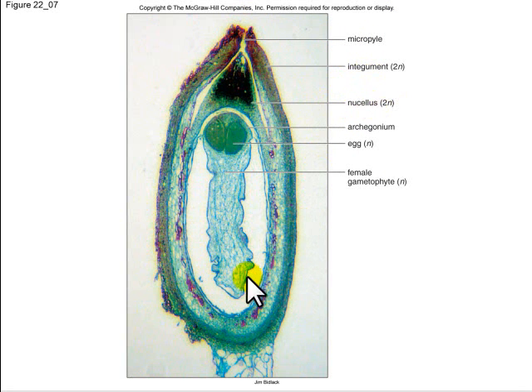But what is this? It's a shriveled up, dried up. Would actually fill all this space in reality. But what is this? This is the female gametophyte in here, the female gametophyte. And what are these 2 structures there? They are archegonia, and it's pointing at what it's calling an egg. I'm not sure we actually see an egg there. An egg only develops at the end of a pretty long process, and this may be well before that egg develops, but this is definitely an archegonium.